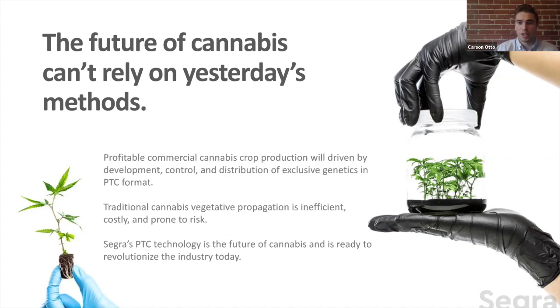No, that's perfect. I appreciate you going into as much detail as you can there. Another one that's come up a couple of times is, what are common challenges you see associated with groups trying to do tissue culture? As they run through the process, where do you see the most common areas of struggle for groups trying to initiate and multiply cannabis plantlets?